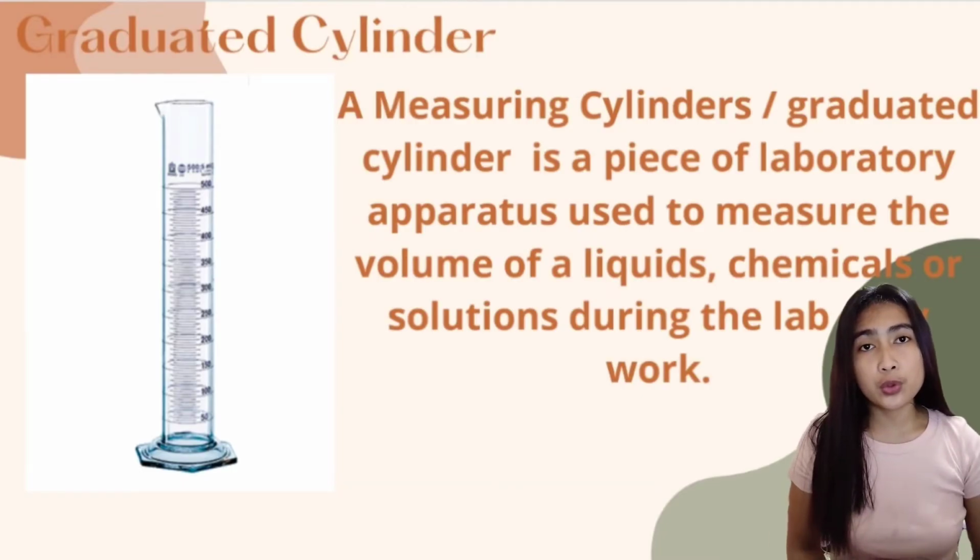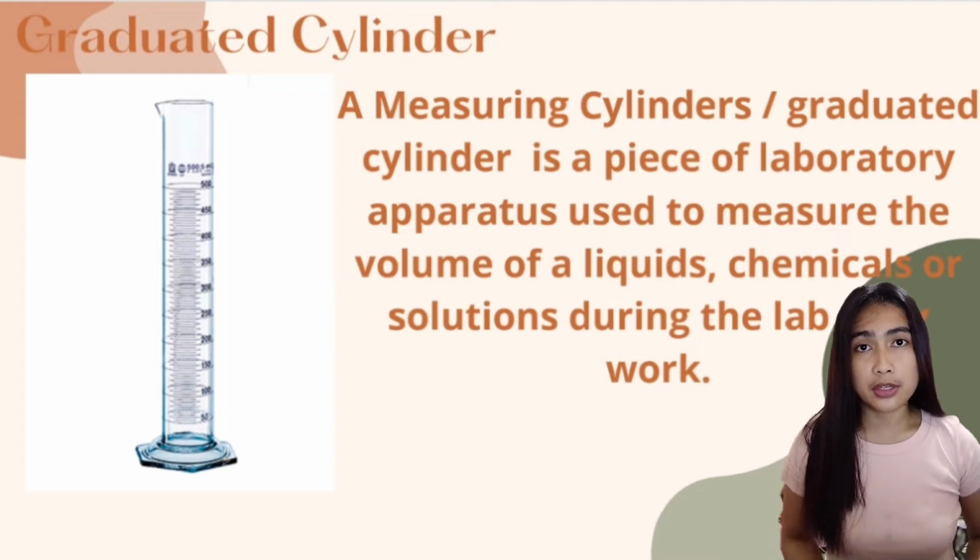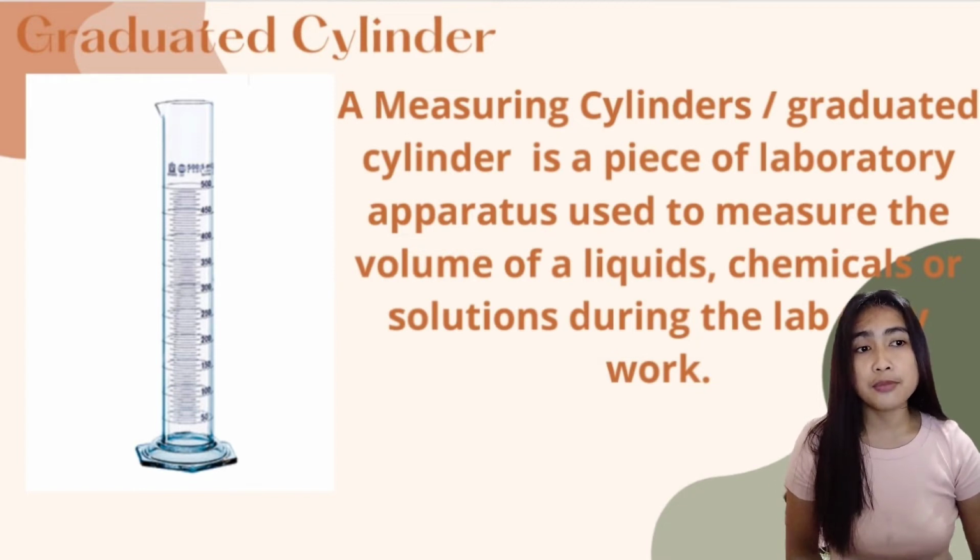So the first tool is the graduated cylinder. Graduated cylinder or measuring cylinder is a piece of laboratory apparatus used to measure the volume of liquids, chemicals, or solutions during the lab daily work.